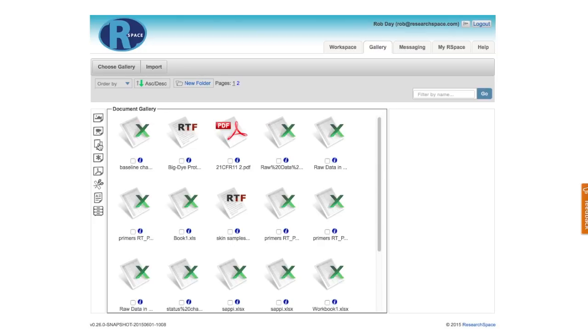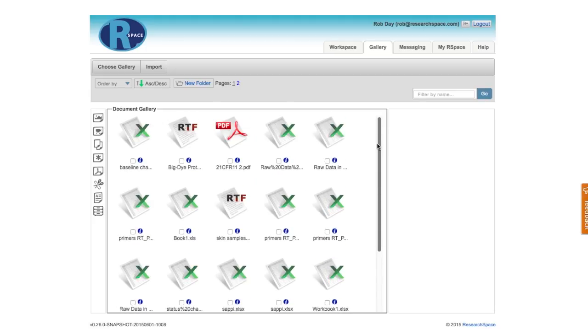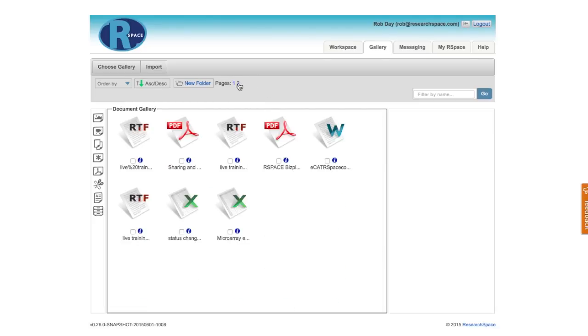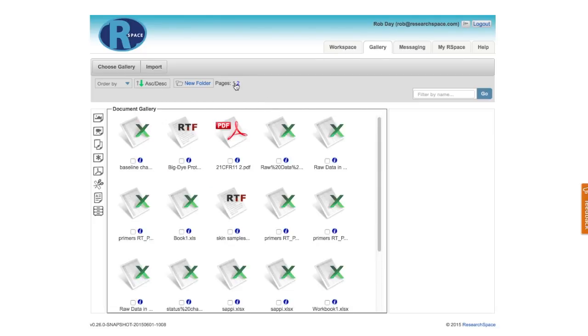When I look at my documents area, I can see that I have quite a lot of files here, and sometimes it's difficult to find exactly what I'm looking for. I can see that the files come arranged into pages, and I can toggle between the different pages, and that may help me.